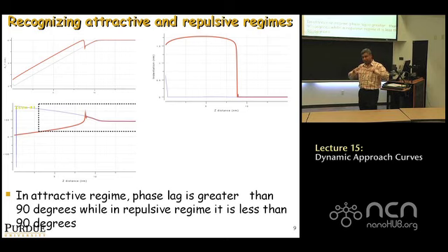Right? That causes the surface to rise up a little bit. So what will happen if there's a net attractive force between the tip and the sample is you expect the material to be pulled up gently a little, net, right? Whereas if you have a net repulsive force, you expect it to be pushed down a little bit inside. So what you expect is when you're in the attractive regime, the height of an object that you image should be higher than the same object imaged in the repulsive regime, although the amplitude of oscillation in both those states is the same. But the same object can be measured higher or lower depending on what state you're in.